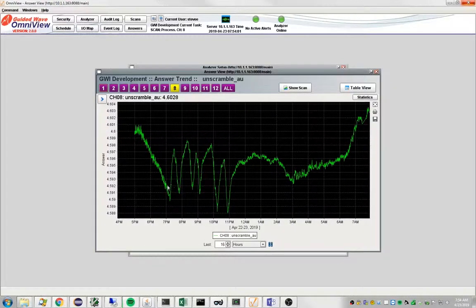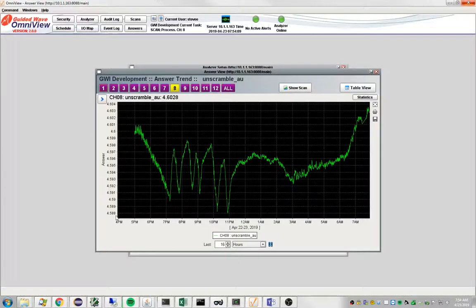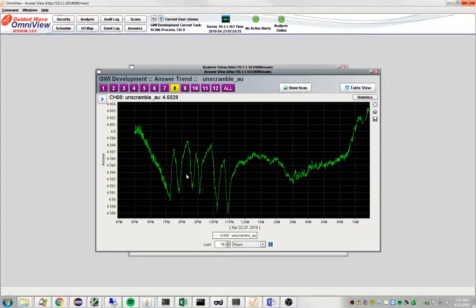You can see my analyzer in my office here doesn't have an air conditioner so the fluctuations you see, they're not very big, very small fluctuations, but they vary with temperatures.